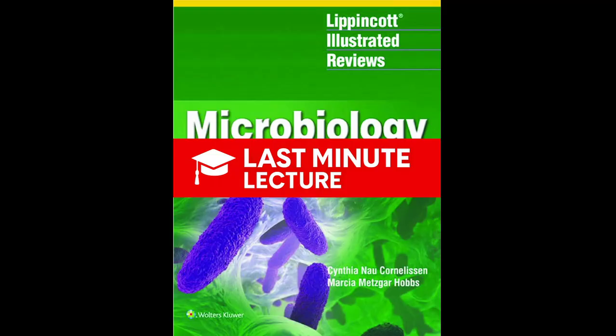And the classic way to do this is the Kirby-Bauer disk test. Very visual. You spread the bacteria all over an agar plate, like a lawn. Then you drop on these little paper discs, each one soaked in a different antibiotic. And you look for a zone of inhibition. Right. If the antibiotic works, it kills the bacteria around the disc, leaving a clear circle, a halo. Big halo means the bug is sensitive. No halo means it's resistant.